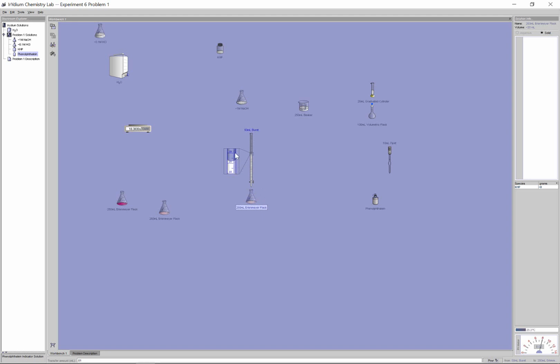This one, it's between the 20 and the 21. So I'm going to say it's 20.8, and it's going to be 20.80. We can always read our burette readings to 2 decimal places. If I just did a quick subtraction there, I can show you roughly what volume that is, 9.78. All right, so that's part one of the experiment here.